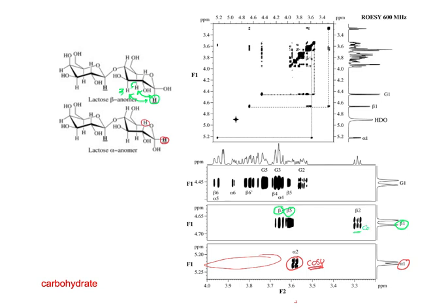So it seems like you can run this, if I'm remembering back. I don't know if they said it here, but if this is a phase-sensitive one, I think the COSY couplings can be in one direction and the NOEs the other direction, or one will show phase information and the other doesn't. I think there is a way that you can see the difference.